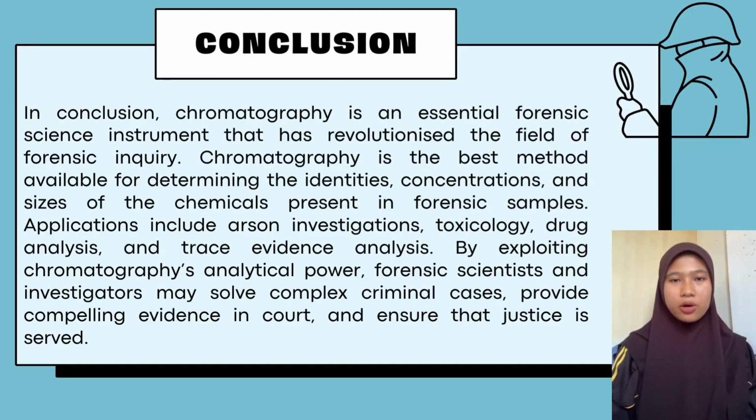In conclusion, chromatography is an essential forensic science instrument that has revolutionized the field of forensic inquiry. Chromatography is the best method available for determining the identities, concentration, and size of the chemicals present in forensic samples. Applications include arson investigation, toxicology, drug analysis, and trace evidence analysis. By exploiting chromatography's analytical power, forensic scientists and investigators may solve complex criminal cases, provide compelling evidence in court, and ensure that justice is served.